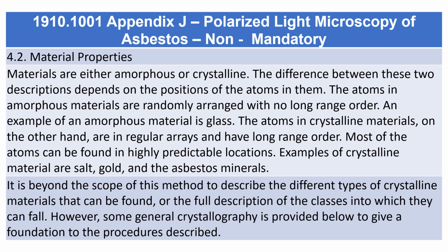It is beyond the scope of this method to describe the different types of crystalline materials that can be found, or the full description of the classes into which they can fall. However, some general crystallography is provided below to give a foundation to the procedures described.